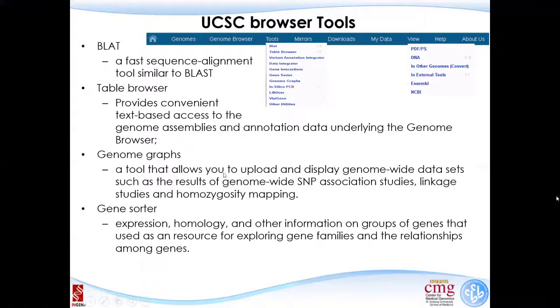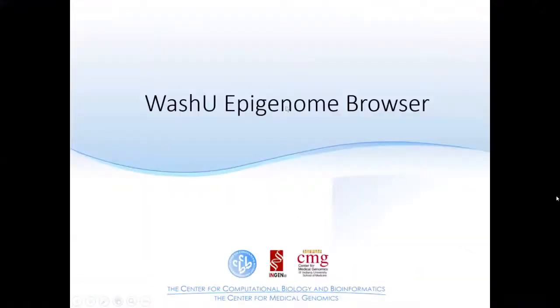There are also some other tools, like Genome Graphs and Gene Sorter. I am not going to talk too much about other tools. You can see all the tools are listed over here. If you are interested in any of them, you can go back to check more detail.